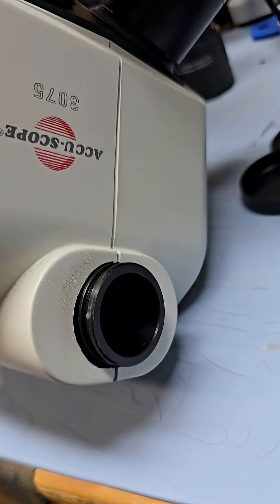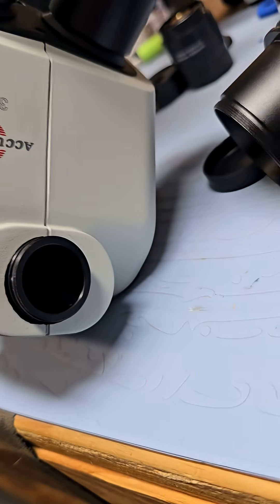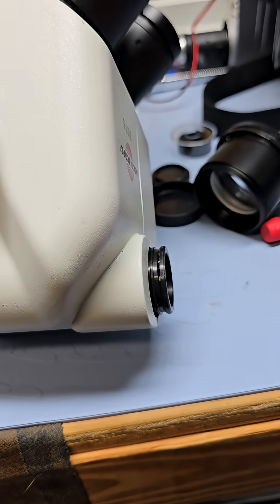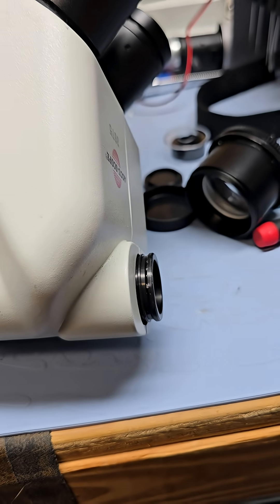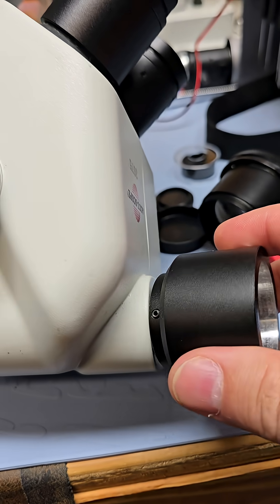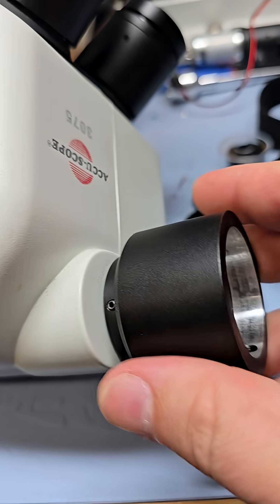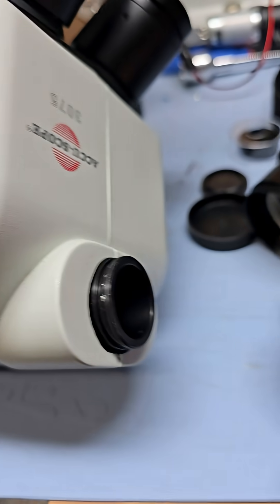And this guy right here, this guy, that's PhotoTube.